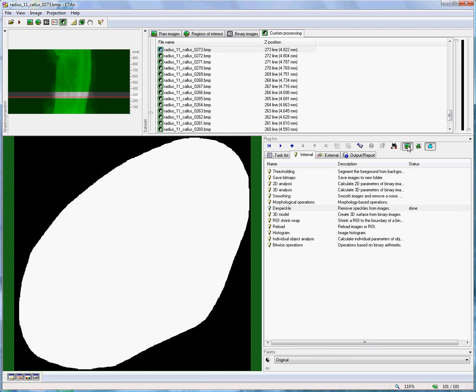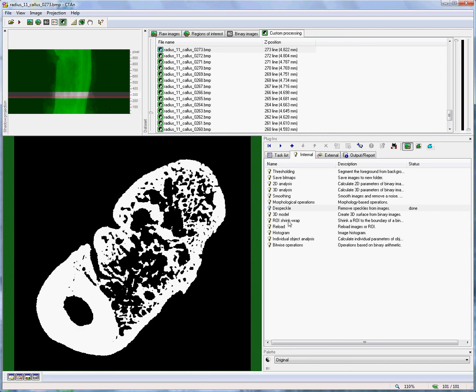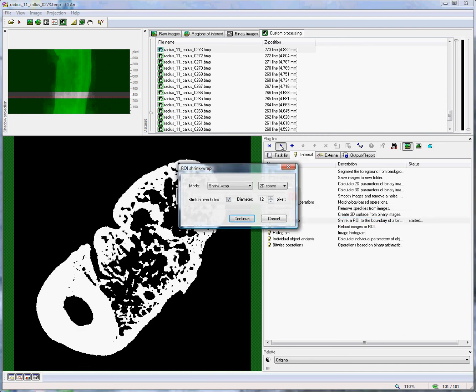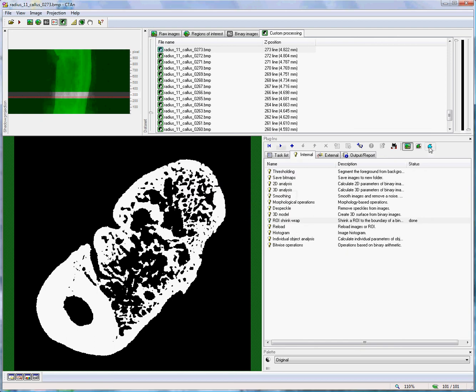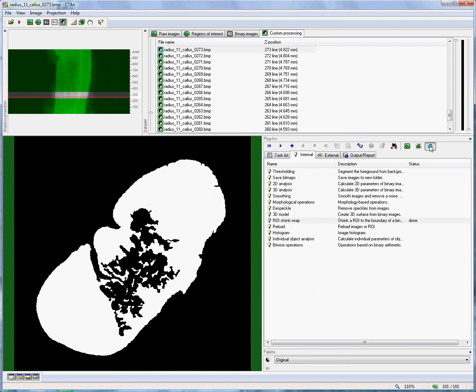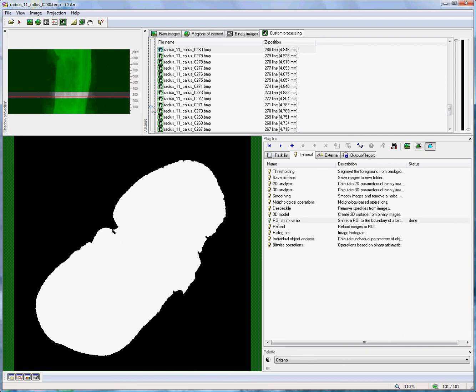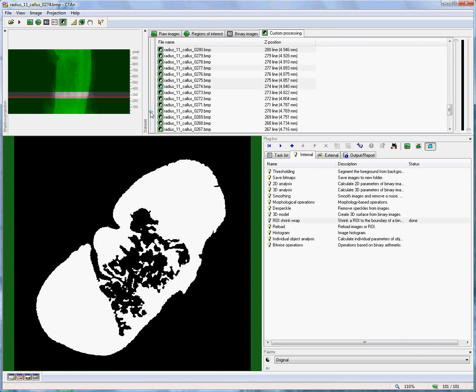However, now I'm going to run the shrink wrap function. I'll run it in 2D space. To begin with, I will exclude this stretch over holes function. The shrink wrap runs rapidly. If I look at the region of interest, we see that there is only partial success. On some levels, the region of interest is stretched around the boundary, but at certain places it goes inside holes in the object because there are openings or holes in the periphery.